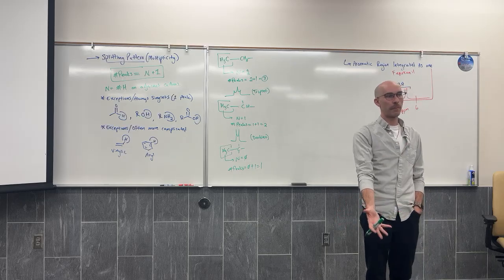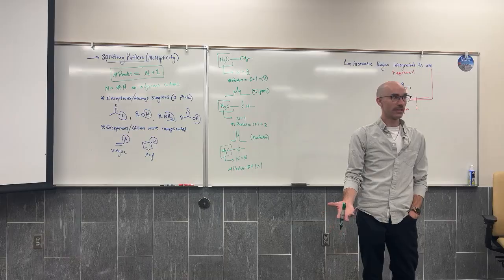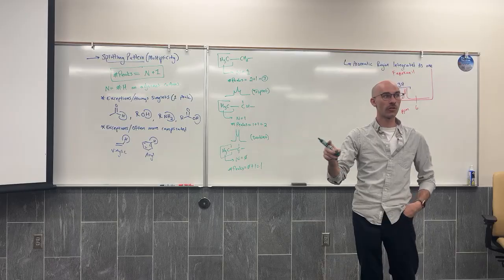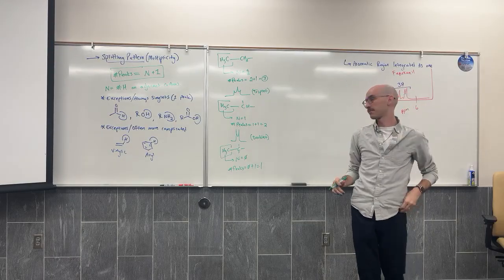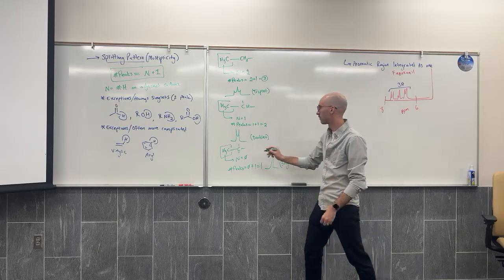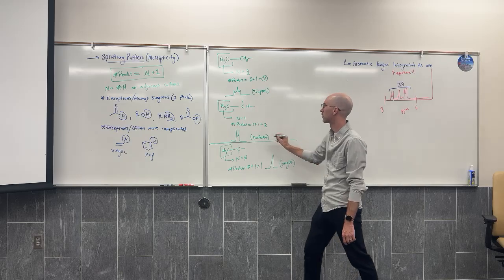Well, it has to have a peak. The hydrogens have to make a signal, so there has to be one peak. It's when neighbors start getting involved that the signal starts splitting into multiple peaks. That we call a singlet. Because if neighbors aren't getting involved, it's not splitting. Exactly, there's no splitting with no neighbors.